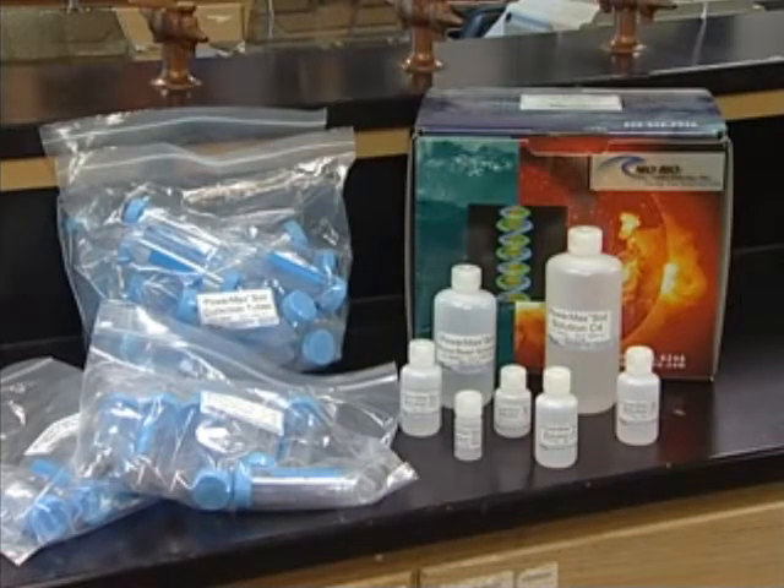For this video, we will be using a MOBIO PowerMax Soil DNA Isolation Kit, which is similar to MOBIO's other available kits, but specially made for large-scale extraction from soil samples.